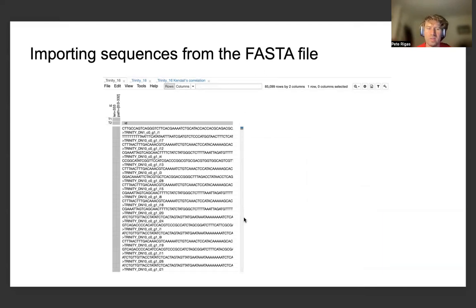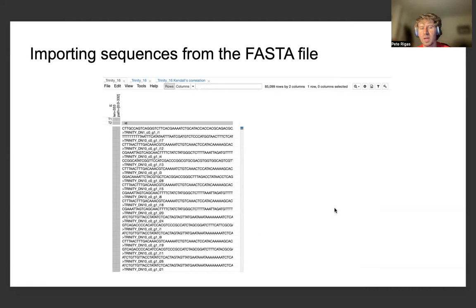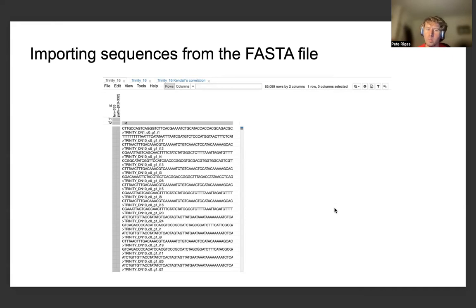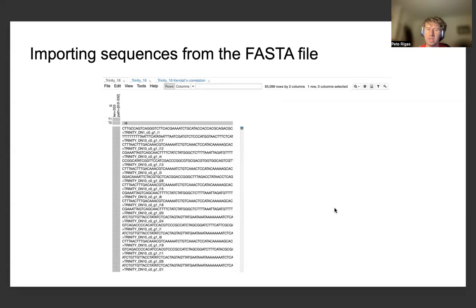We can see that there are a little more than 85,000 rows. After we import the FASTA file, we can see it is characterized by an ID as well as the DNA sequence followed by it, and a barcode identifier. These sequences were produced by the Trinity transcriptome assembly procedure, a bioinformatics pipeline introduced by developers at the Broad Institute — namely Brian Haas and colleagues — which produces full-length contigs for predicting different types of characteristics of the transcriptome. One can take the FASTA file output from the transcriptome assembly and more easily interpret and look at all sequences together to perform different types of automated computational routines within Morpheus.